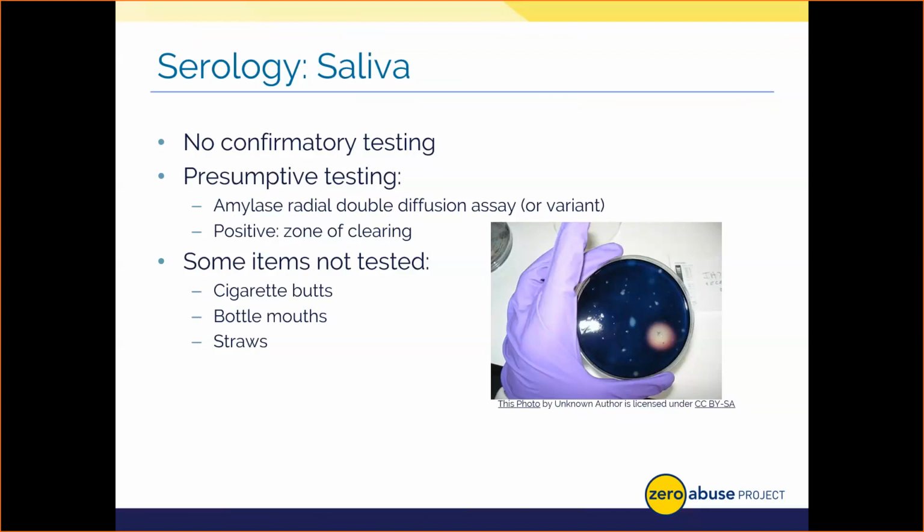Now we incubate, in other words, we let each plate sit at 37 degrees Celsius. If you need to do the math, that's about 98.6 degrees Fahrenheit, or body temperature. So it mimics the human body temperature. For anywhere from 18 to 24 hours, we let this sit in that incubator. So again, we're trying to get the enzyme to act as it would in the human body. Typically, leaving a sample in for the full 24 hours is better, so as to give the amylase the appropriate amount of time to do its work, to act in an enzymatic fashion.